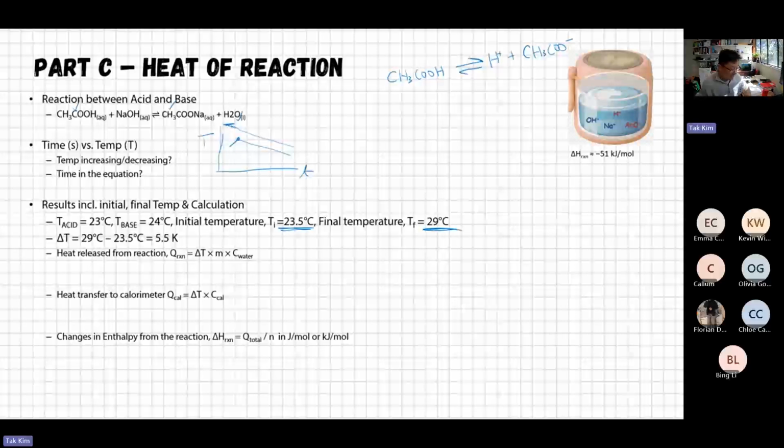If I did it, I might have a higher or the same temperature because I didn't do the entire experiment while I was running a lab class from 6 p.m. to 9 p.m. Anyway, it'll be the same process. You use delta T, and the mass will be the total mass. Right? And then heat capacity, same as the previous one, use the heat capacity of water.